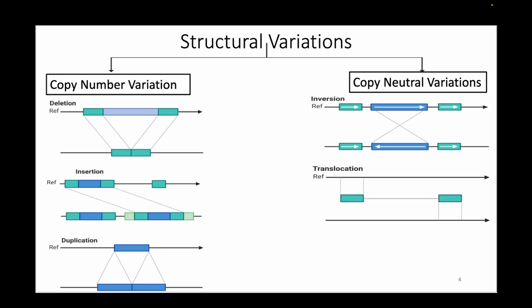On the other hand, if there is a duplication like this, say the middle region has been duplicated and the flanks of the duplication region are fine. The reads will come and align to the flanks, so the coverage around the flanks will be the same, but in the duplicated region the coverage will dramatically increase because you have a duplication in your sample.